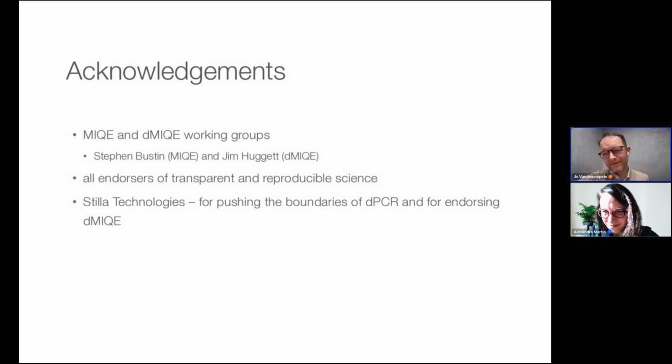For target specific, I think there is no secret. I think the primers are the more important elements in multiplexing, so that there is no off-target or cross-homology or non-specific amplification occurring. That's relatively easy to check. You can do a singleplex, you can do the multiplex, and the quantitative results should be the same. And the probes are merely a detector. So I think probes have not a real impact in multiplexing, except for the fact that if you start combining too many classic hydrolysis style or hairpin style probes, your background may become too high.